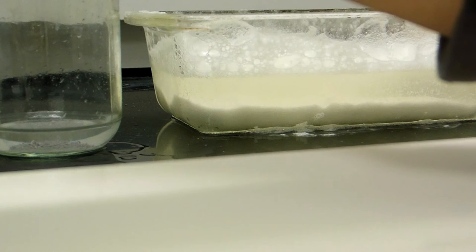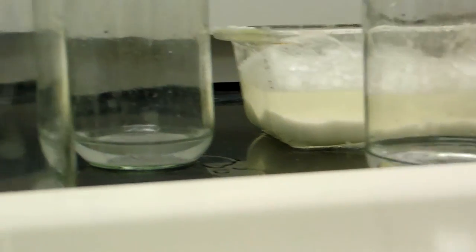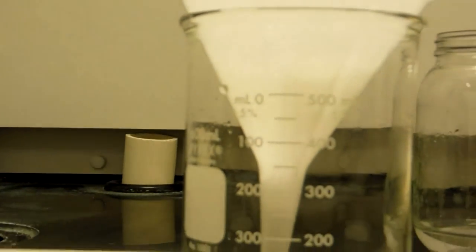So I have a really bad camera angle right now for some reason. So anyway, I pour it into the funnel. And as you can see, the flow rate is quite rapid, which is a good thing. So now I move on to the next step.